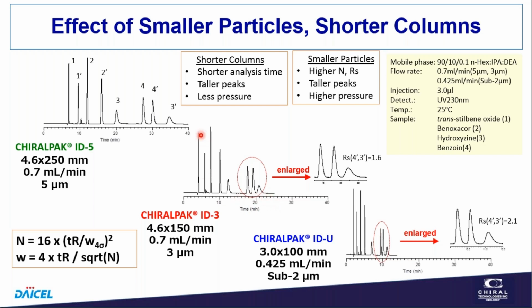These peaks are on the same time scale, but not the same response scale. But we can see that these peaks are sharper, so they will be taller because area is conserved. So this gives us an advantage. We see the same general behavior going from the smaller particles.